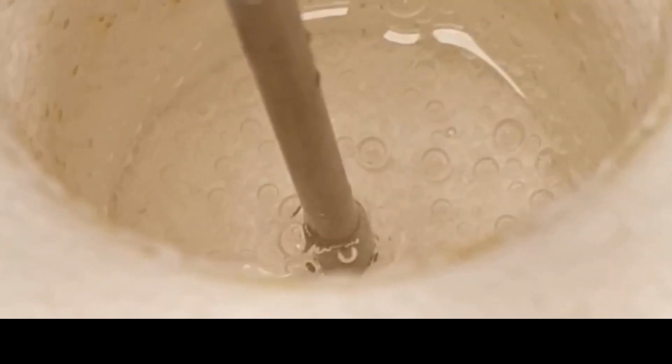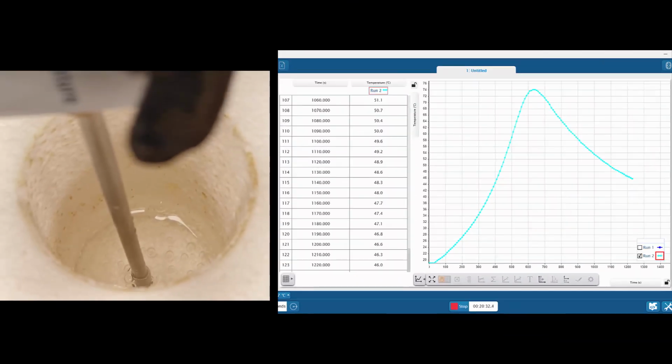And as I said before, their gradient is much, much steeper than mine. I had massive cooling effects because of all the loss of hot oxygen gas just constantly coming off, it being warm itself, so steam coming off. So all of those assumptions are terrible, and that shows up in the data.